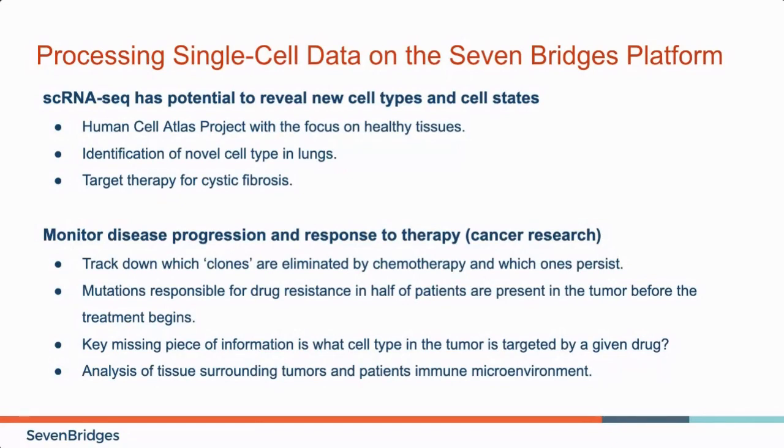Also, single-cell transcriptomics gives potential for mapping patients to the right cancer treatment. Additionally, how well a drug works also depends on what is happening in the surrounding tissue. Single-cell analysis of tumor environments provides a complete picture of disease progression and patient's response to treatment. And we showed a segment of such analysis in our presentation today.